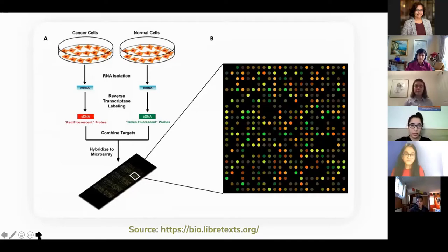In microarray expression analysis, the sample has genes from both the normal as well as the diseased tissues, which are distinguished using dyes. The brightness intensity of a probe after hybridization denotes the gene expression levels. And that light intensity is converted to a numerical value, and that is the data which we will be examining.